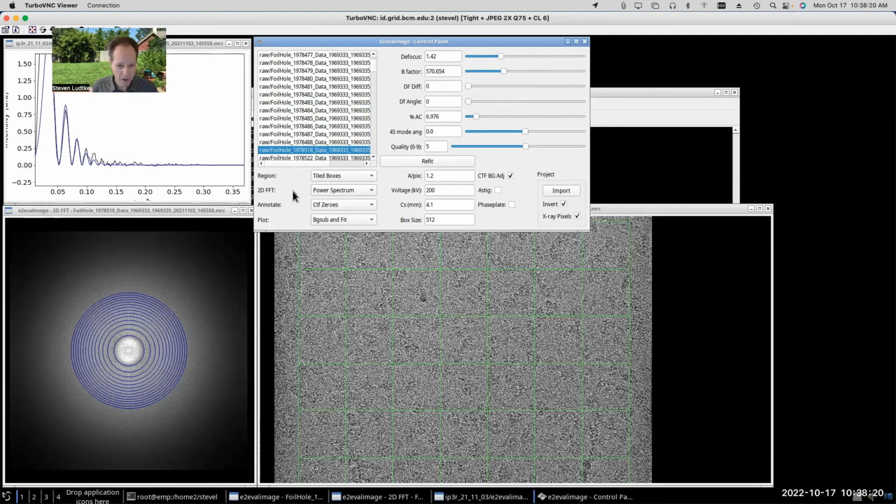The detector is another factor. The physics of how the electrons interact with the detector means that you don't get perfect localization on the surface of the detector. The size of the pixel in the detector is somewhere around 7 microns. And when an electron at 300 keV or 200 keV impacts the surface of the detector, it doesn't just stop. It interacts, and then interacts again, and again.